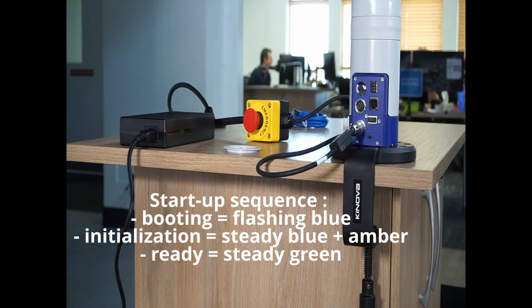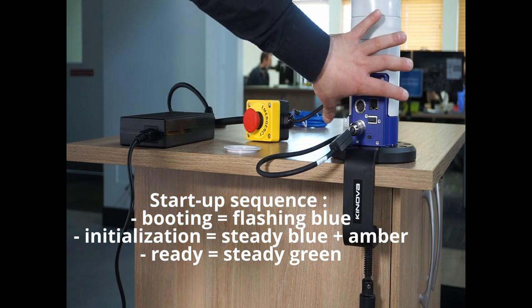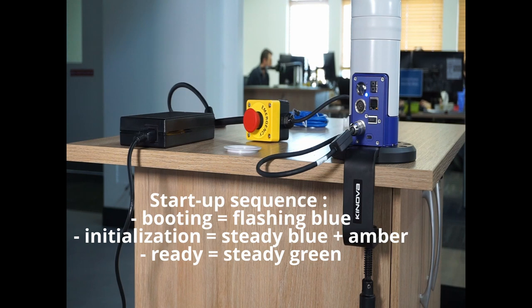First, during booting, the LED will flash blue. Then, during the initialization process, the LED will be blue and the second LED will be orange. Finally, when your robot is ready, the LED will be green.